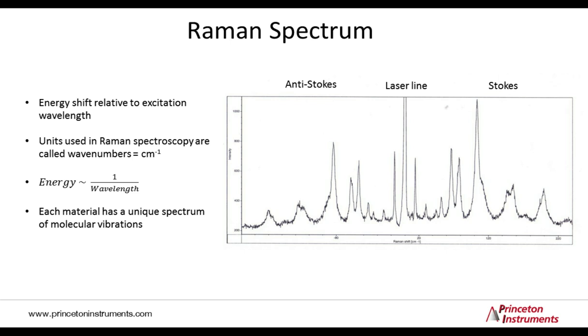That originates from the fact that the Raman energy shift is very conveniently used because it's mostly independent of laser excitation wavelength. However, the energy of a photon is inversely proportional to its wavelength, so that's why the inverse units.